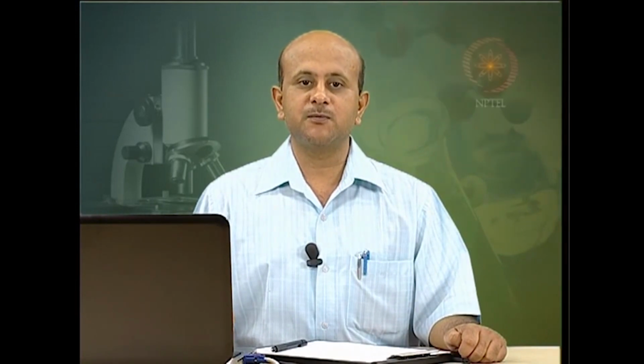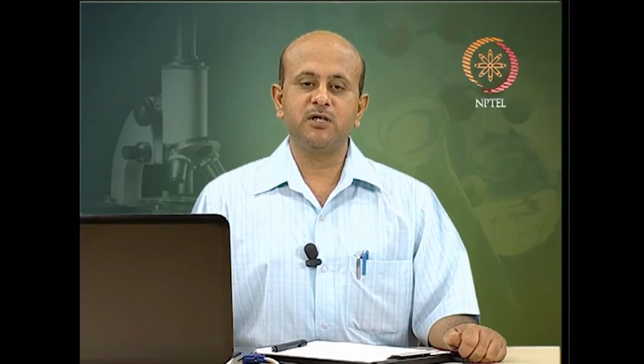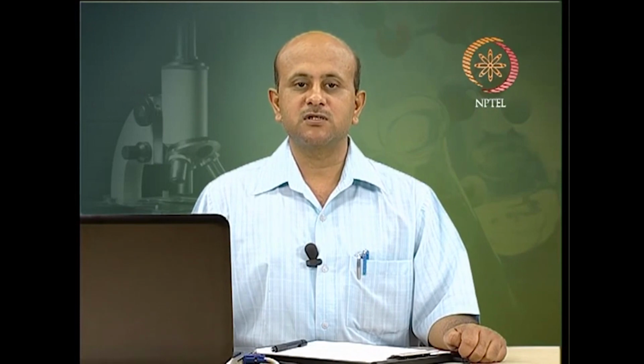To summarize this lecture, we have discussed different types of centrifuges, right from the simple benchtop centrifuge to the high capacity refrigerated centrifuge, high speed refrigerated centrifuge, and ultracentrifuges, where we discussed preparative and analytical ultracentrifuges, and also the different optical systems employed in analytical ultracentrifuges with their applications.